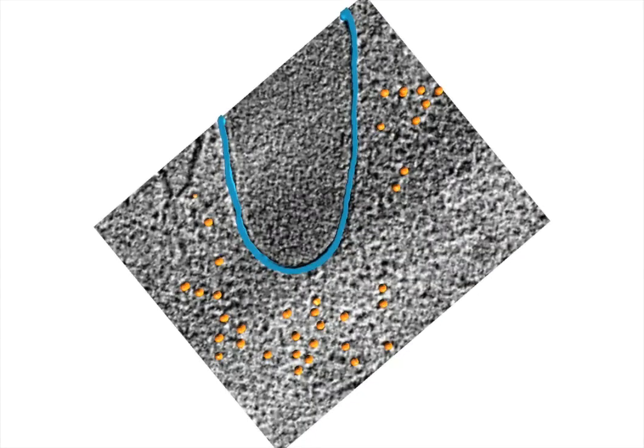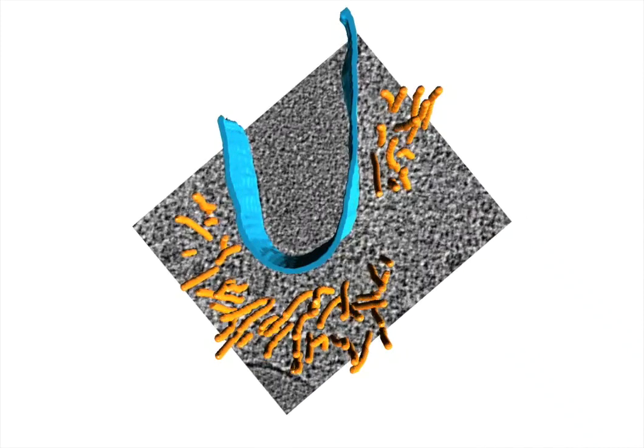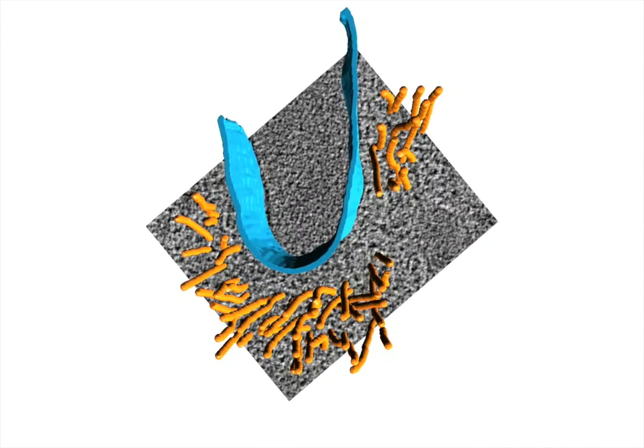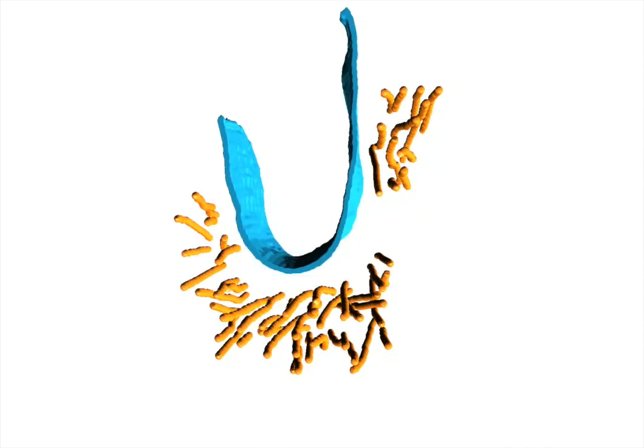Three dimensional segmentations of the septal membrane and the actin filaments were generated for structural analysis. From these segmentations, it is clear that the actin bundle is composed of straight filaments running circumferentially around the mid-cell, nearly parallel to the membrane.